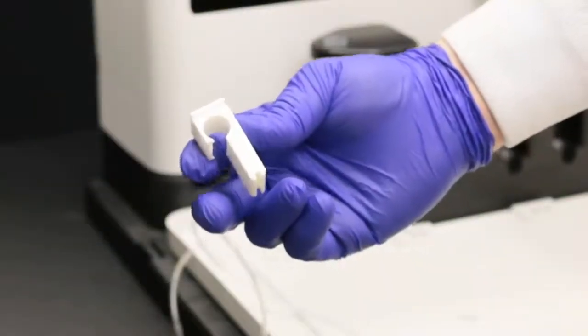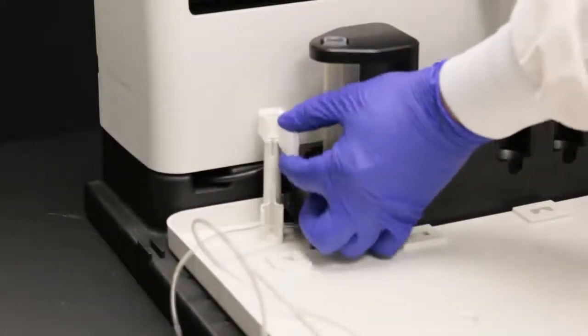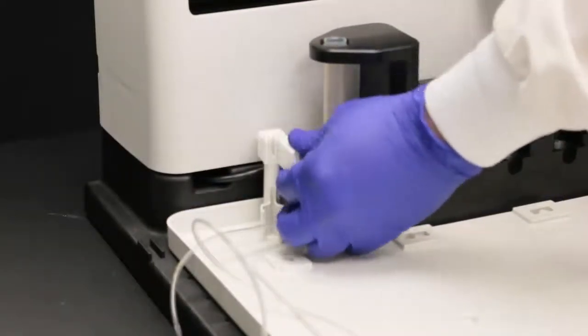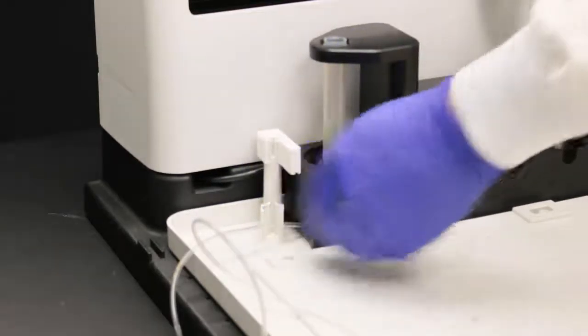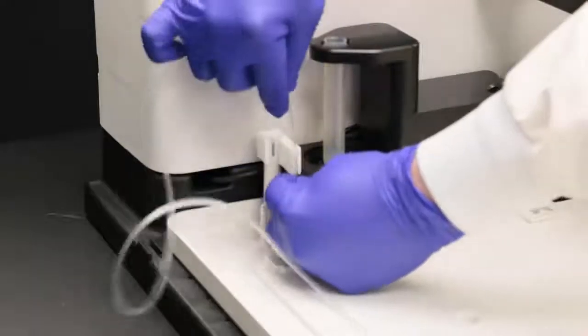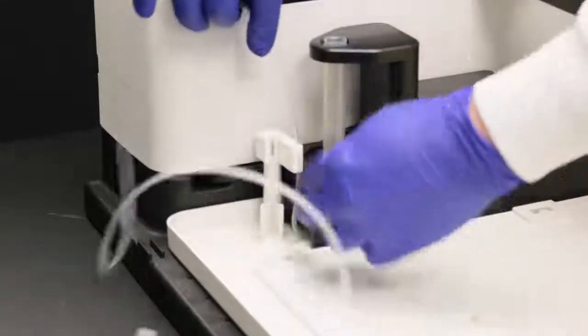Press the tubing holder straight down onto the rinse station support post. Press the vortex vessel tubing into the grooves in the tubing holder. Allow enough slack so the tubing is not stretched or kinked.